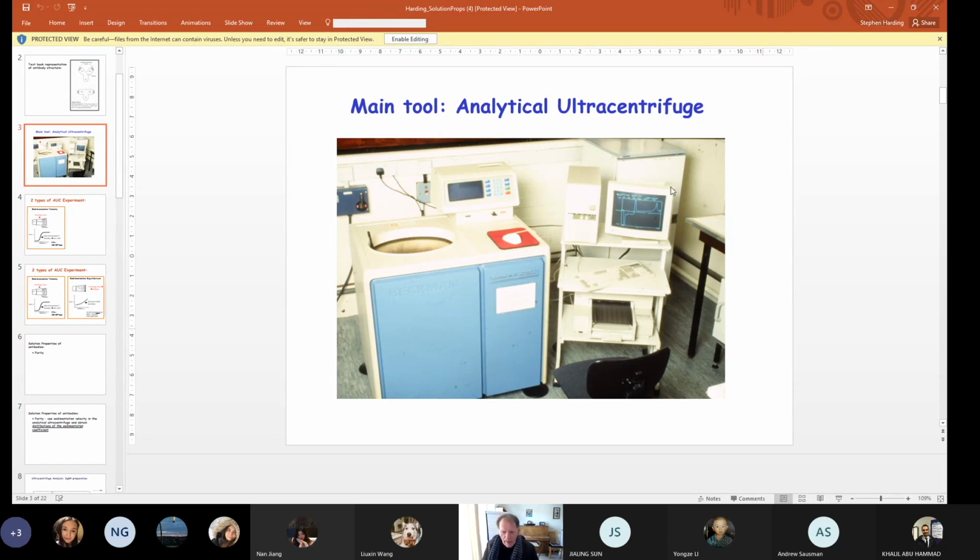And that's what an analytical ultracentrifuge is, which I know looks like a washing machine, but this instrument, the Optima analytical centrifuge, is regarded as a gold standard instrument for assessing the solution state of antibody molecules. So it's worthwhile focusing on this one as part of our antibody biotechnology course.